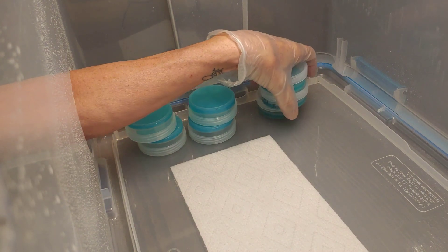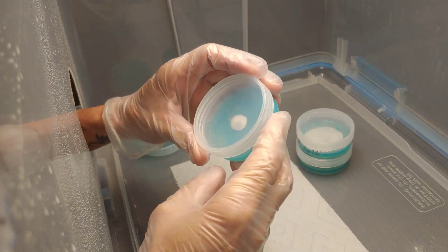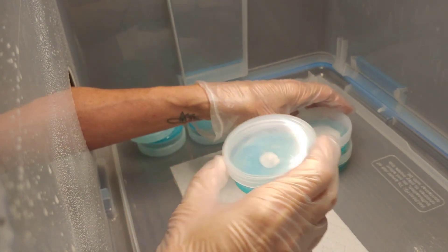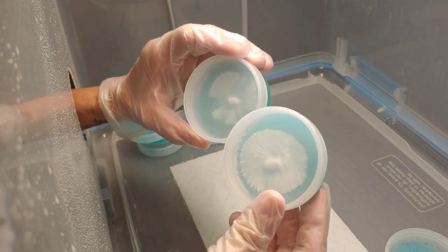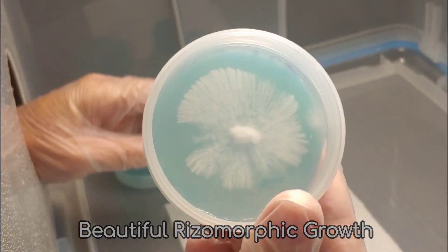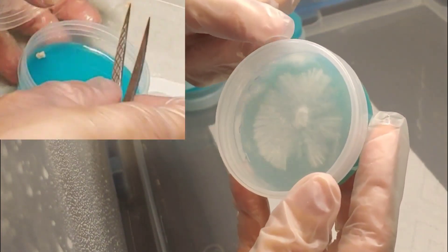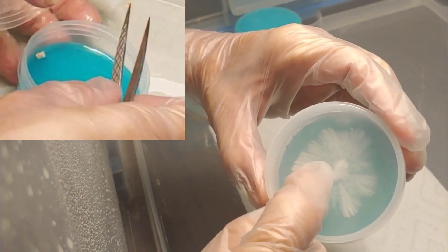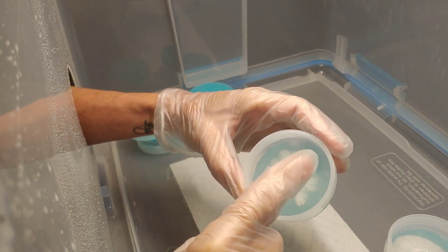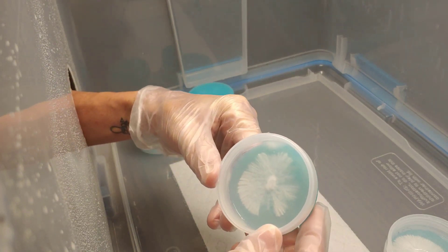So this is eight days later and we put one grain of rice in each one of these — look at the difference. This is the slowest one, and then we got these two. Look at this one and look at this one. Each one of these you can still see the little grain of rice in the middle. And if you notice this little white speck down here — this is the one where the grain of rice jumped around and hit that corner, and I had to grab it from there and put it back in the middle. So you can see how just laying there for a second dropped some tiny pieces of mycelium and it grew there. It's pretty amazing.